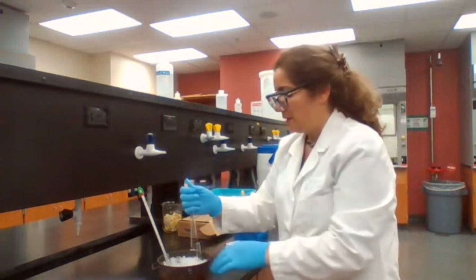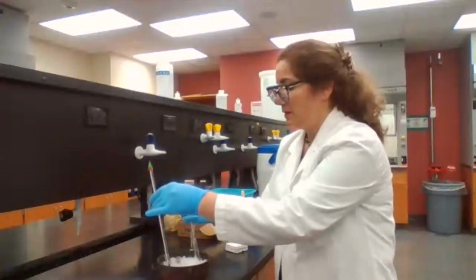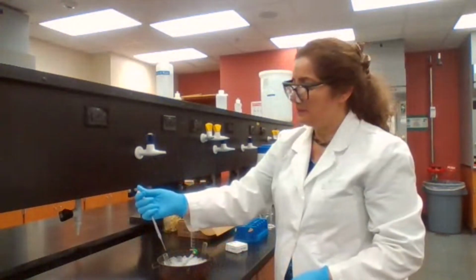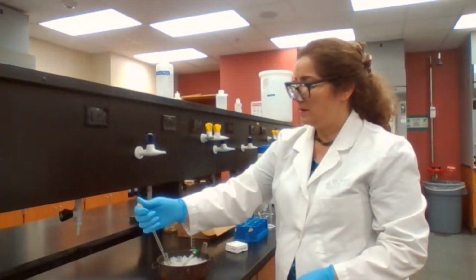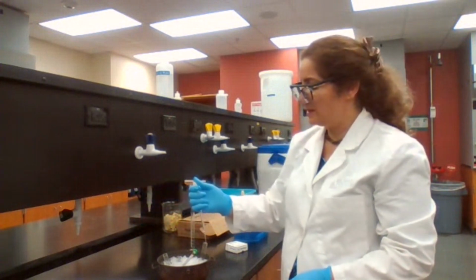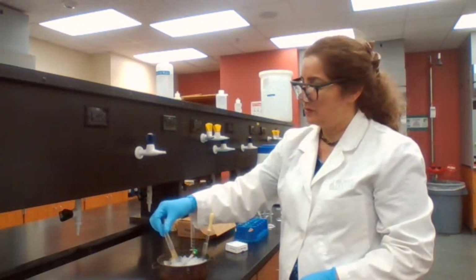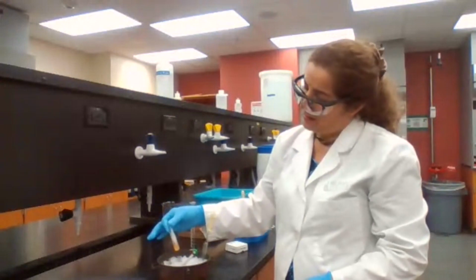Okay. Going to add the nitronium ion, 1 drop at a time, to the methyl benzoate mixture. I'm going to mix it and wait.